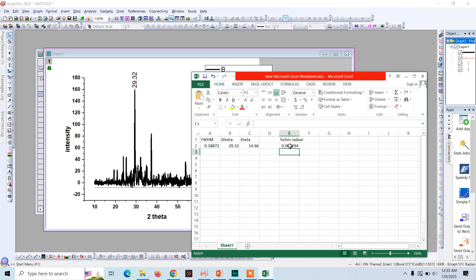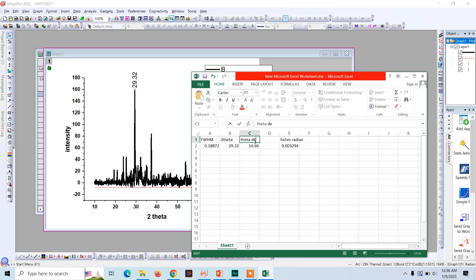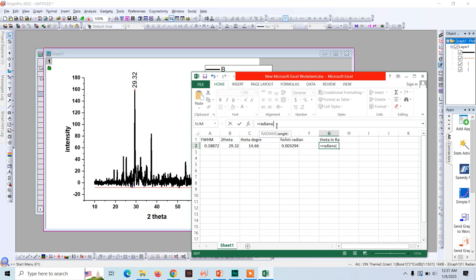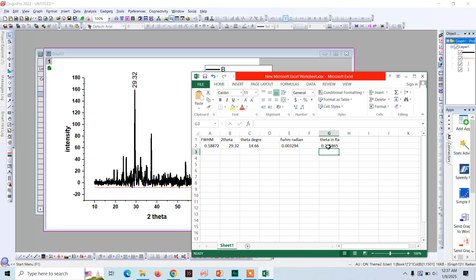And now this is the value of FWHM in radians. Now we need to convert the value of theta which is in degrees here to radians. This is theta in degrees. We need to convert this to radians. It is equal to radians like this. So this is the value of theta in radians.